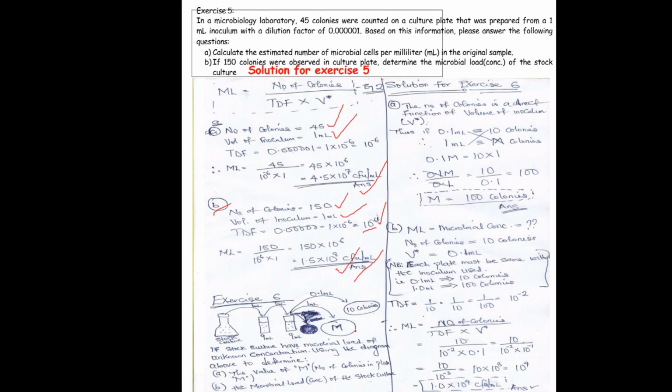So now basically we are looking for the number of colonies in this culture plate M, which is not given. You may know every other thing, but you don't know the culture plate, so we can now use this equation to try and find out. But the trick of the question now is that there's another inoculation that was done with a reduced volume of inoculum. This was done with 0.1 from the same culture, from the same test tube, dilution factor.